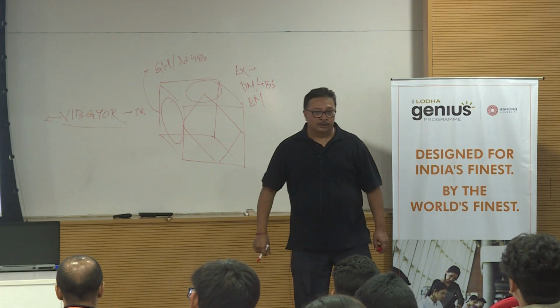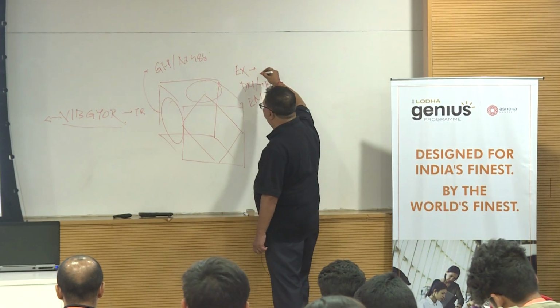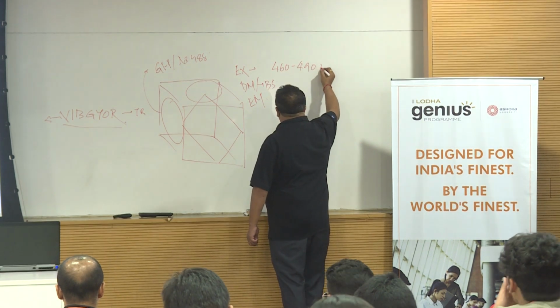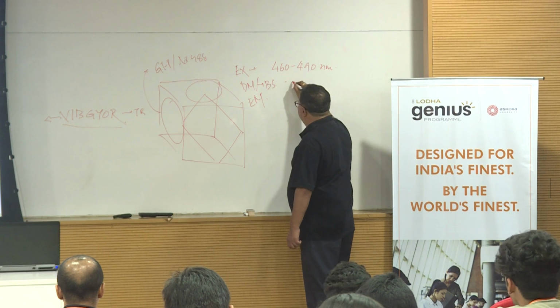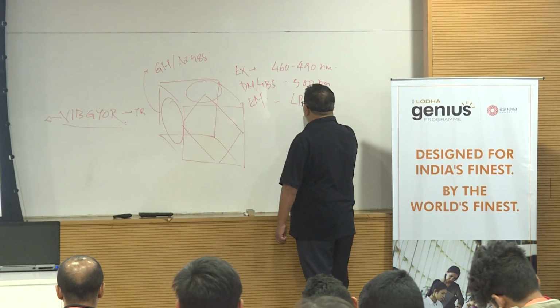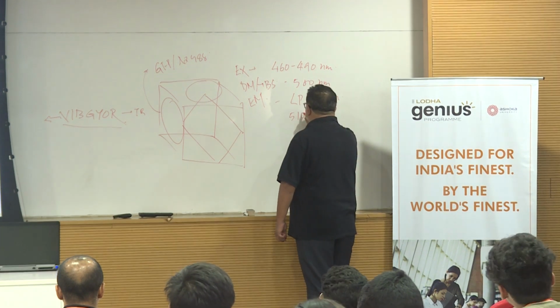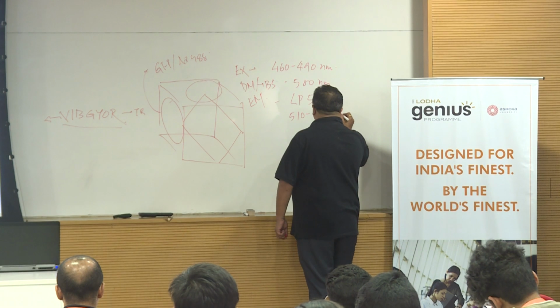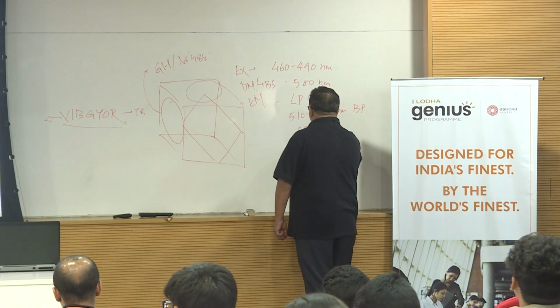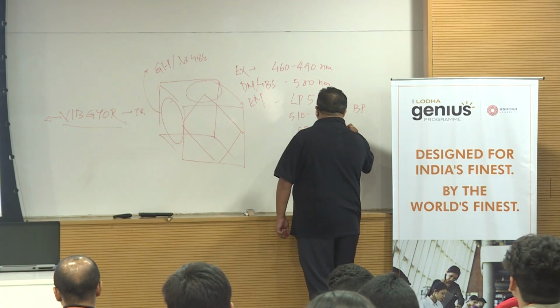EM stands for emission. So, a typical GFP filter or Alexa Fluor 488 filter shows specs like this, and sometimes something like LP 510 nanometer, or 510 to 550 nanometer BP, or 525 plus minus 50 nanometer.